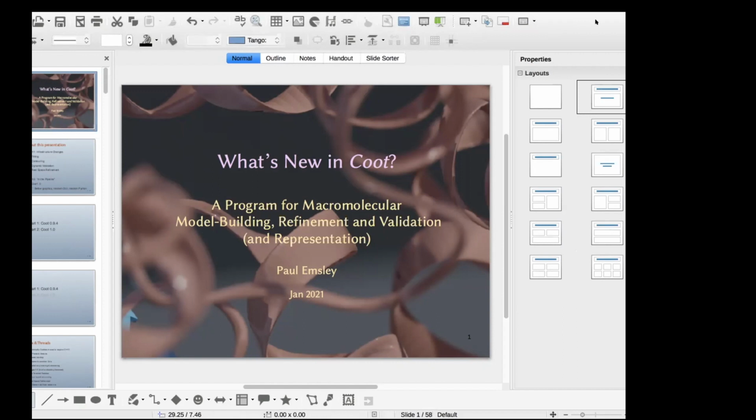Part of the reason I invented the challenges was that I thought Coot's power was not being exploited. With a speedrun, you can get easy in, easy out, in less time than it takes to boil the kettle. You can do all of your model building, going from an R factor of 25% to 16% in the time it takes to make a cup of coffee. That power of Coot wasn't apparent, so that's why I invented the challenge.